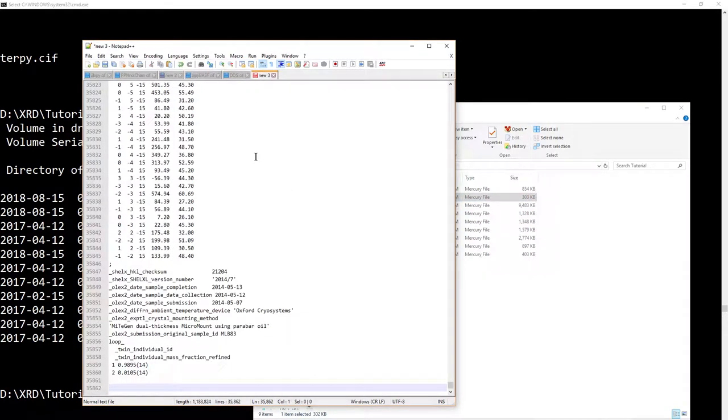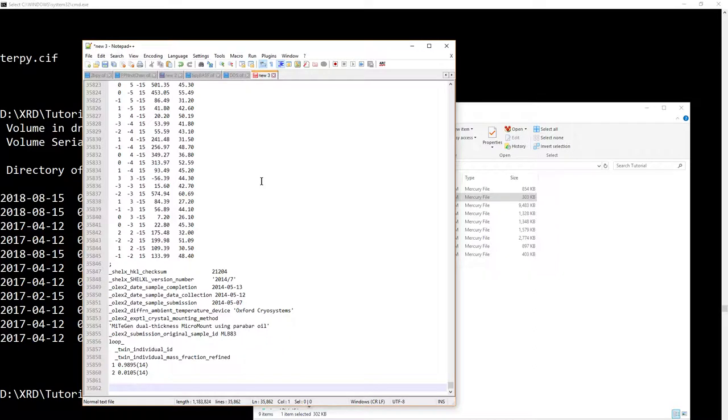So, I think it's a lot faster, especially when you get into having a lot of these at once. And it makes it easy to see what the order is rather than copying and pasting them. That's just my opinion. I hope it helps.